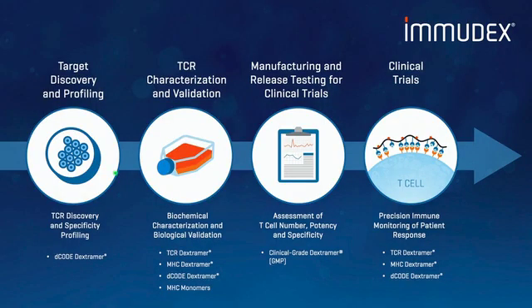So just to give you an overview, we've now been through the initial epitope discovery. We've talked a bit about TCR validation and characterization, and the next step in the production of a TCR T-cell based therapy would be to introduce the TCR into cells and go for initial testing of the cell lines and then into clinical trials.